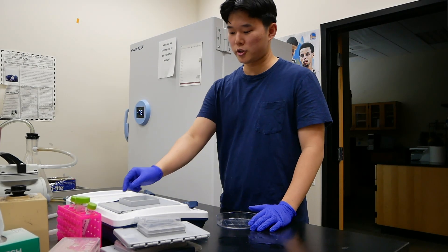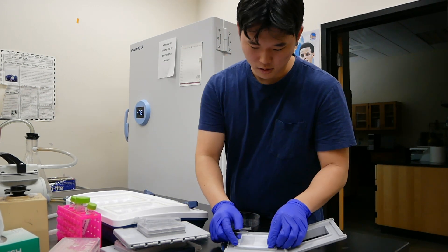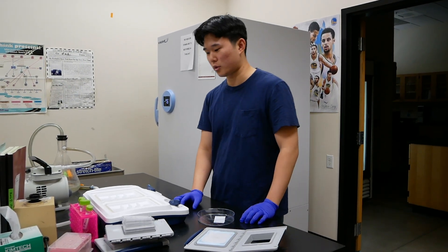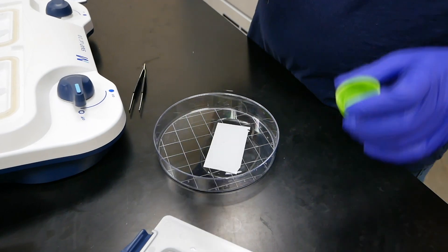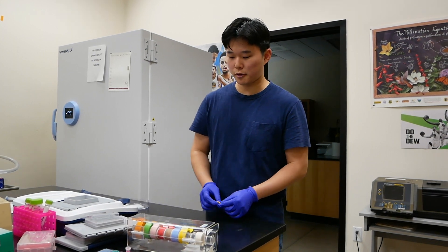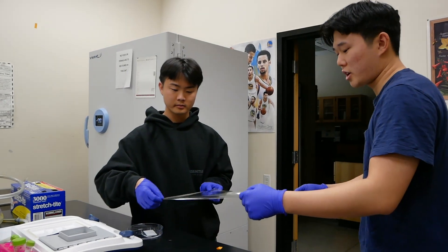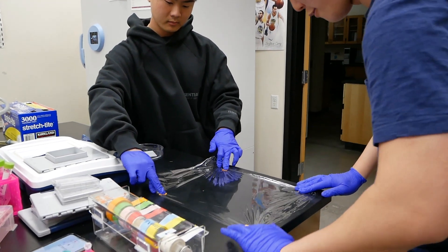After washing the nitrocellulose membrane four times with the wash buffer, we'll now remove the membrane from the SNAP-ID and add it to the petri dish. After adding the nitrocellulose membrane to the petri dish, we'll use the assay buffer made from TBS and Tween and pour it twice every two minutes, with 20 milliliters per pour. While we wait, we'll be making a flat working area by putting four corners of tape for the saran wrap to be placed on top.